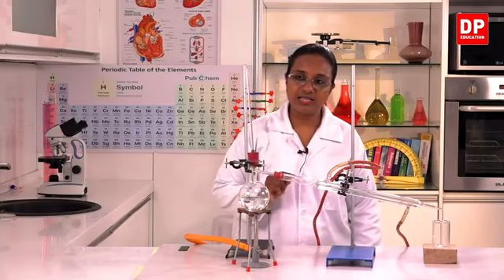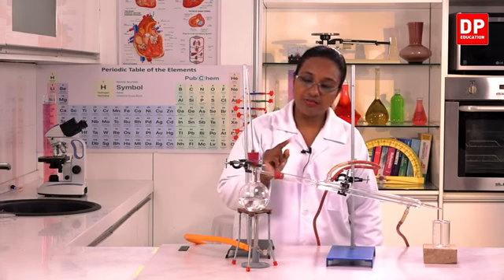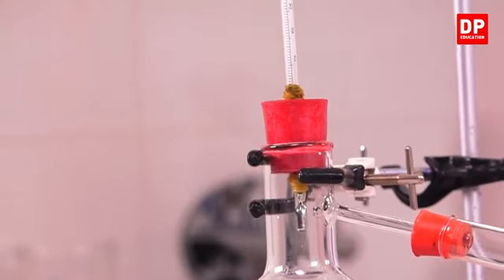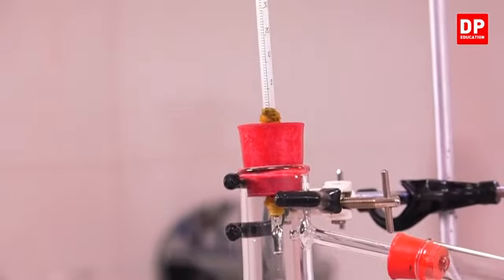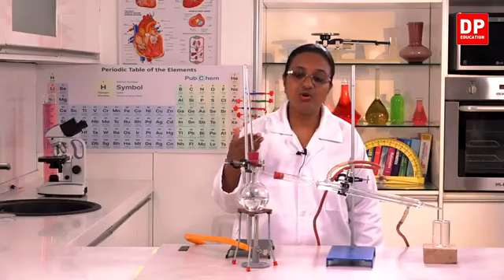is placed under it. And if you go up a little bit, if you can observe clearly, there is an outlet for the steam to come out from the round bottom flask. So that is the point from which the steam will escape or come out of the round bottom flask when the solution starts to boil.